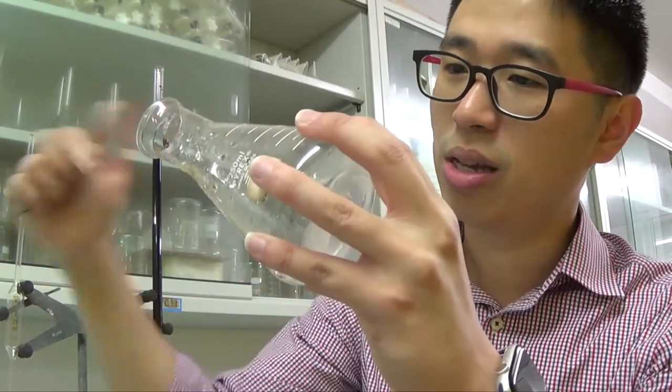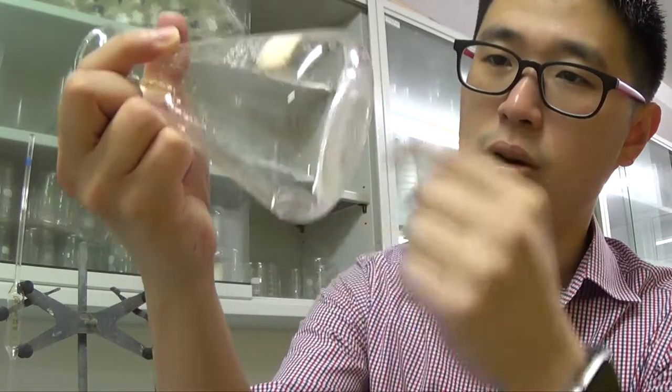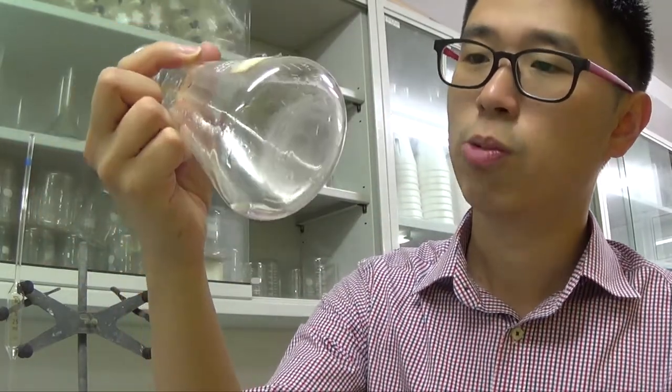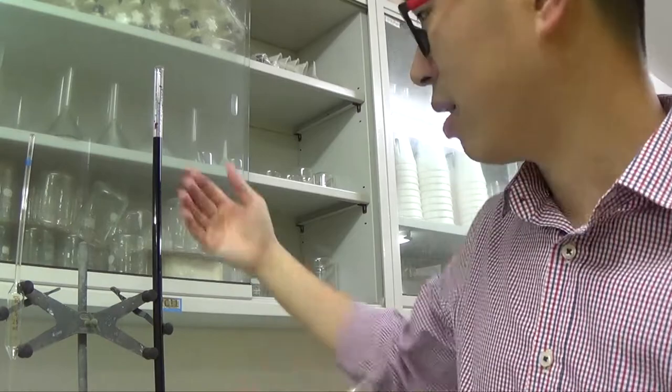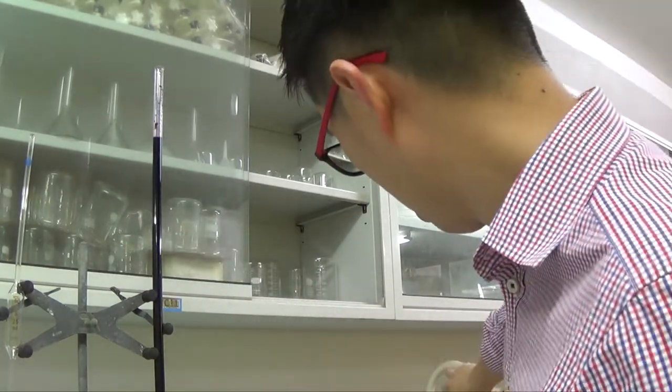But if you have a little bit of water in your conical flask, whatever you prepared in is the same mole quantity, irrespective of whether you use a dry conical flask or a little bit of wet conical flask with distilled water. It will not affect your end point because the mole of the stuff that you prepared out is the same and you're just titrating against the thing in the burette, okay?